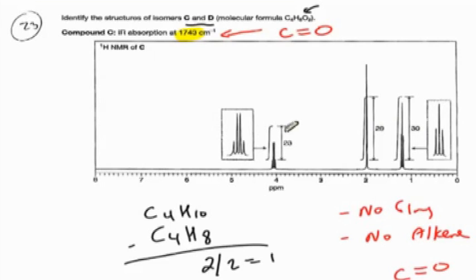Whatever you divide one by, divide the rest by. So I'm going to divide by 10 to get this to 2.3, because that's closer to the number of H's. Remember the rule: when you have a number of H's given, these have to add up to that number, right? So obviously 23 is big, and that's why I'm going to divide it by 10.